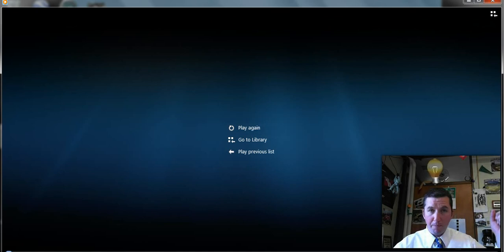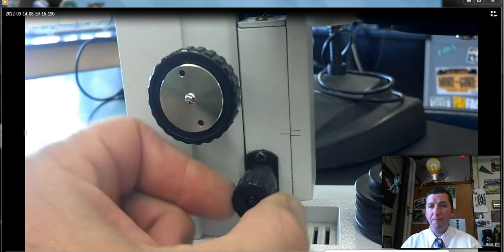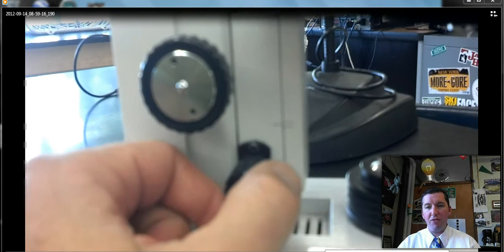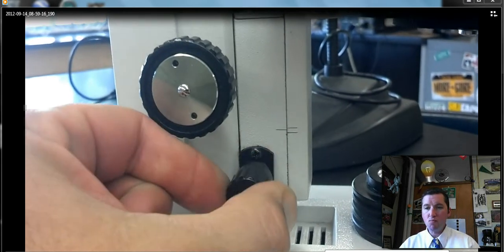All right, so here's a very bright idea. Is that cheesy enough for you? All right, I'm just going to show you really quick that, believe it or not, when you turn the fine adjustment, it actually does do something. So I'm going to show you real briefly here in this video. So if you notice as I'm turning that dial, all right, if you watch those two lines and you watch that line on the left, that line on the left is actually moving, all right, in between those other two lines.